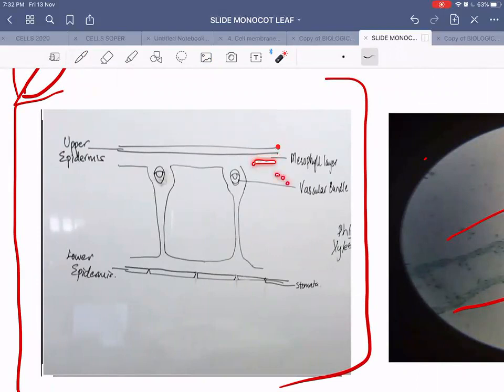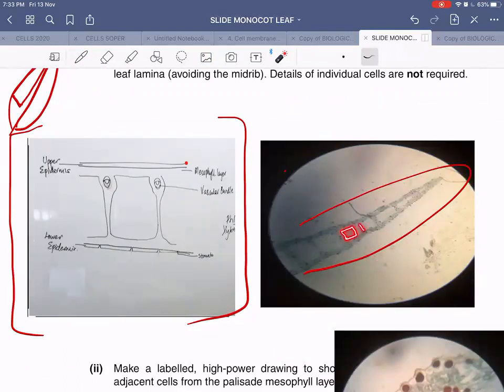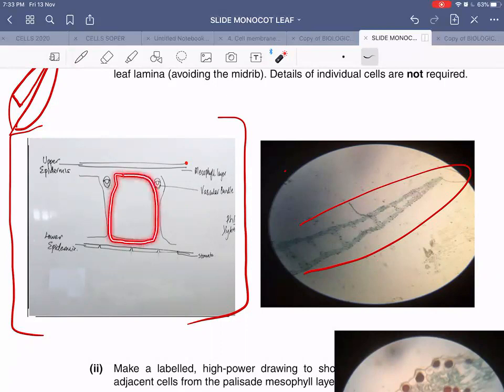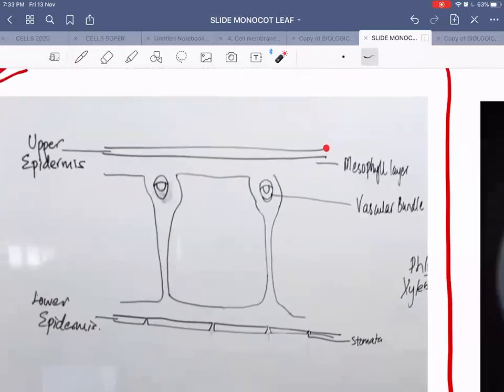Below the palisade layer you can see the spongy layer. When you zoom into the slide you'll see more clearly. This leaf has very large air spaces in the spongy mesophyll — larger than in the previous leaf studied. To represent those air spaces in the low power plan diagram, you draw them like this, and in between you can see scattered tiny vascular bundles.